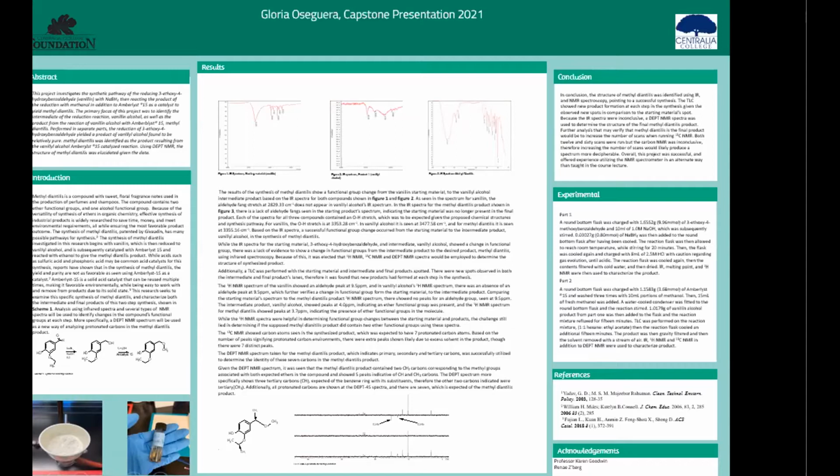I'm not really familiar if this instrument will detect carbon-14. Carbon. Oh, sorry. Carbon-14, if I can answer that question, carbon-14 would be invisible to nuclear magnetic resonance. It is only odd molecular weights or odd mass numbers or odd atomic numbers. And so carbon-13 is the only carbon isotope that would be available to this particular instrument.